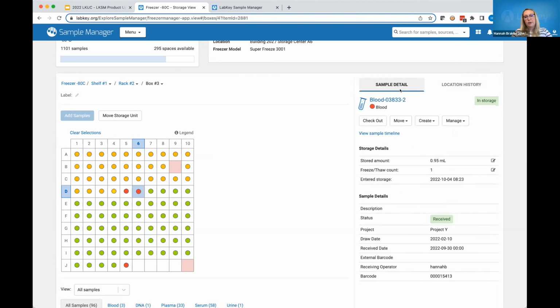You can do it individually, of course, but the other way that I might recommend doing this is using a file upload. I mentioned that at the beginning with sample registration. You can also use a file to update samples within the system. In that case, where it might be very granular, very different between samples, you would be able to make a bulk update in a single go.